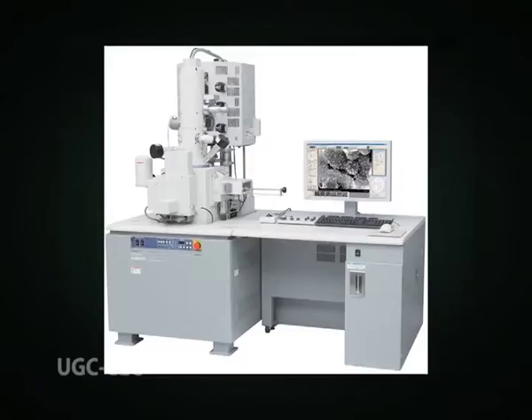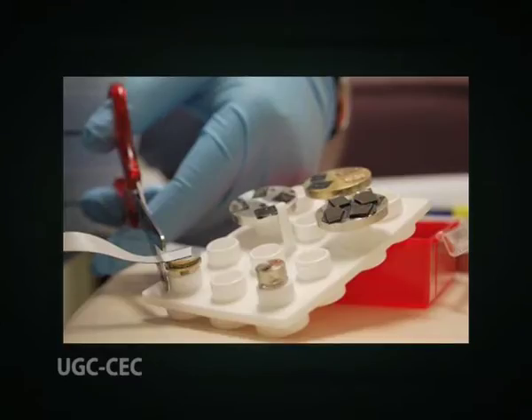The images are observed on a monitor and photographed using a 35 mm camera from a special monitor. Some advantages of SEM include relatively simple sample preparation, wide range of magnification, high depth of field, and the fact that the image is a representation of electronic data, allowing for image analysis and quantification.